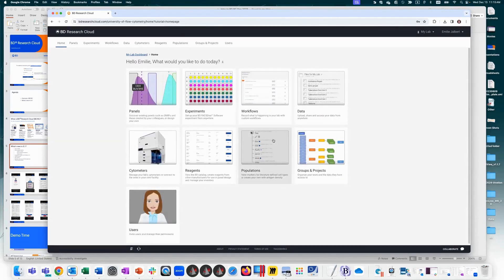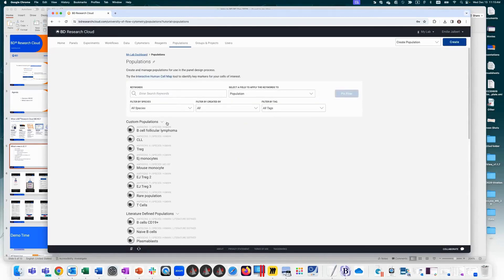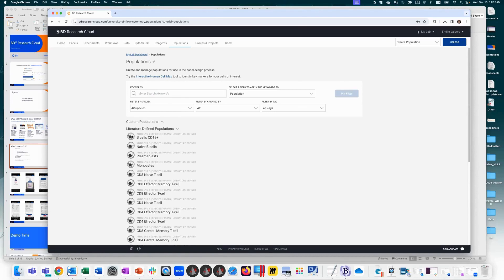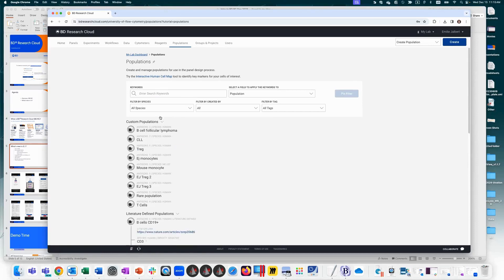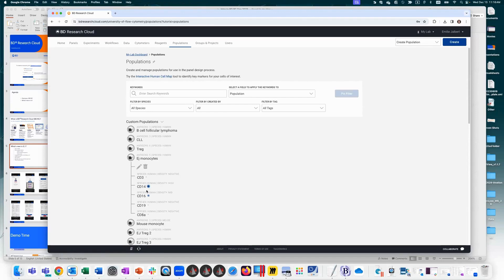In the populations section, you can define your own population antigen density. BDRC comes with literature-defined populations along with citations showing basic markers that define certain cell populations. Users can add custom populations, since antigen density can change based on cell type, conditions, and isolation type. You can upload antigen density information specific to your lab conditions, and during panel creation you can import all markers at once rather than adding them one by one.